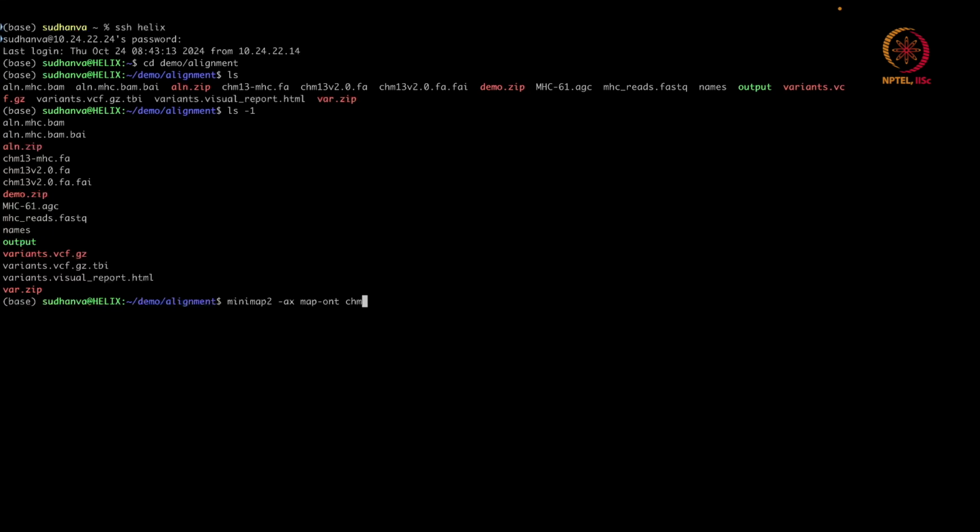I will pass the CHM13 reference genome as the reference, and I will pass mhcreads.fastq as the query sequences. And we will pass this output onto alignments.sam.